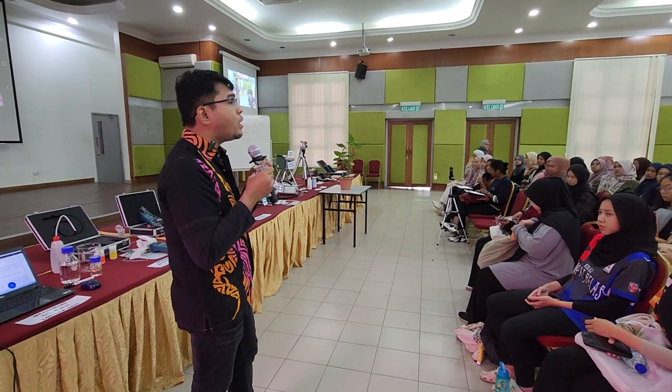Okay. However, EC doesn't tell you one thing. It doesn't tell you whether the high or low reading is due to which ions. It doesn't tell you that you actually need to do further testing or send to the lab. For example, let's say the EC is high, one millisiemens. But we do not know whether this one millisiemens is due to dissolved nitrate or dissolved phosphate, for example. It just tells you the overall story of electrical activity.